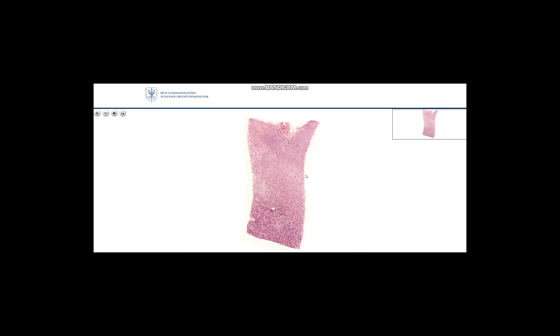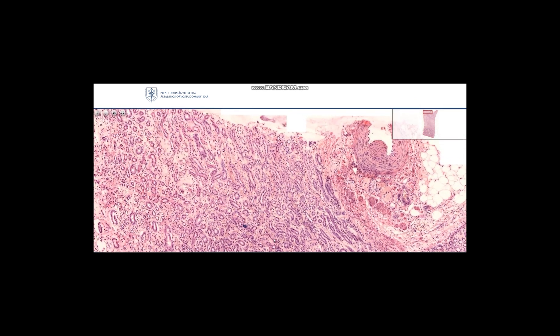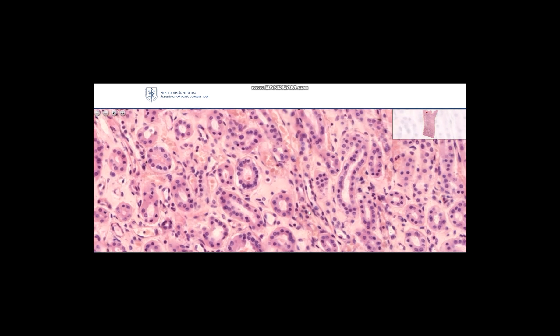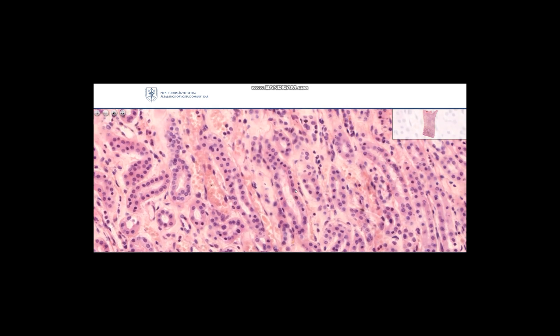If we enlarge this preparation, we will see tubules in longitudinal and cross sections. For example, here you see a nice cross section of a collecting tubule, lined with cuboidal epithelium. In the case of cuboidal epithelium, the height and the width of the cell is about the same size, and the cells have round nuclei.